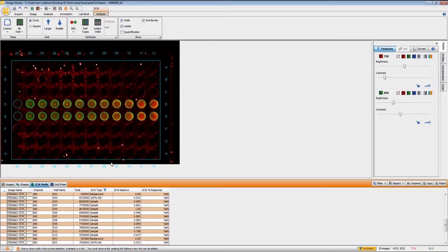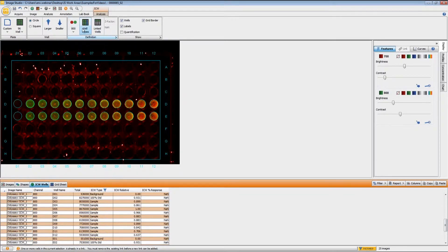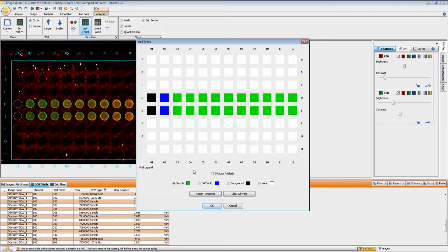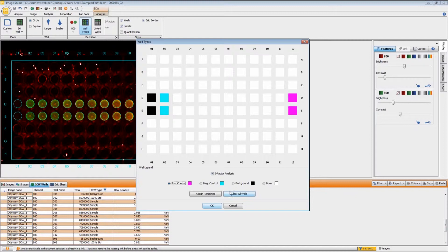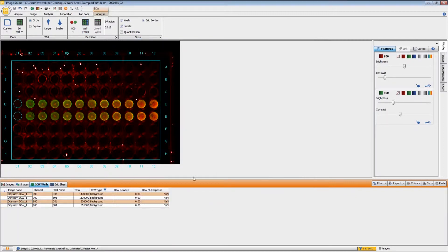Not only can you do the InCel Western analysis, you can also do a calculation called the Z factor. To set that up, under Well Types change the selection to Z Factor analysis. You'll see different options: I'm still going to set my background, then the wells with the lowest signal I'll designate as the negative control, and my highest signal will be the positive control. When I click OK, you see that the Z factor calculation is listed right here under Z Factor.